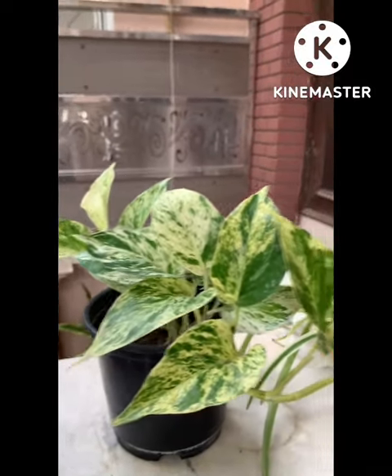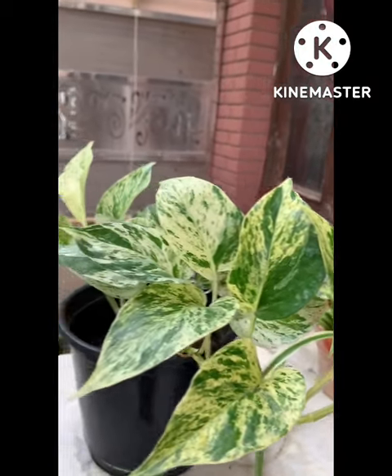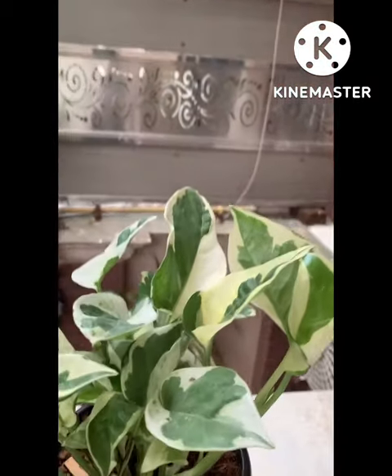We do a little preparation. So children, in this garden there are some mani plants. This is a variegated variety of mani plant, this is also a variegated variety of mani plant, and this is a normal green plant as you can see. We take this variety which has variegated leaves — some parts are green and some parts are white.